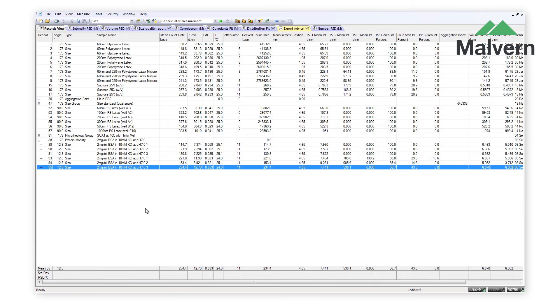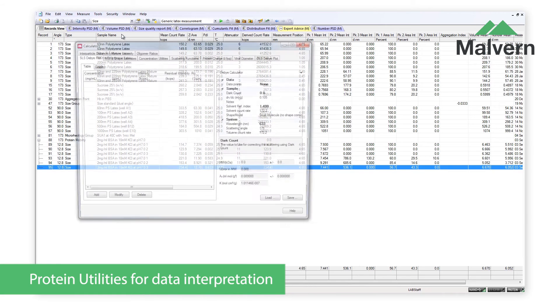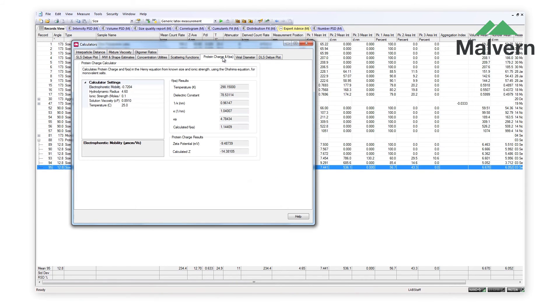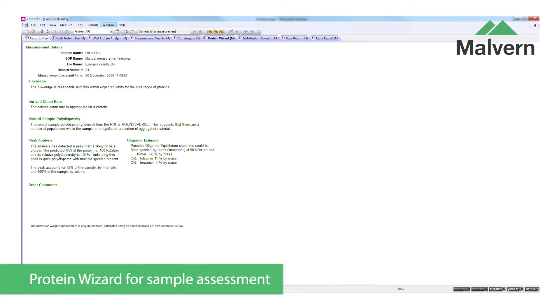The Zetasizer software has been designed with protein scientists in mind. The built-in protein utilities are a set of tools designed to help the user with experimental design and interpretation of the data. An expert report in the software called the Protein Wizard can assess your sample from a number of points of view.